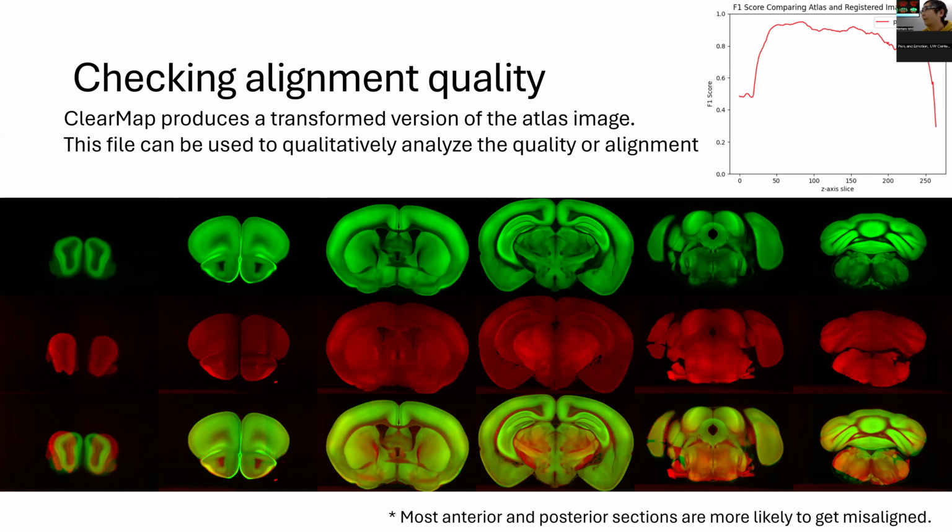That's key part one. There are also some more robust types of alignment algorithms, so you can look into that. This is a more general thing, but I think there's not a good template atlas for the spinal cord or anything posterior. So that's a completely new topic. You just need a better atlas for that so that you can use it for alignment.